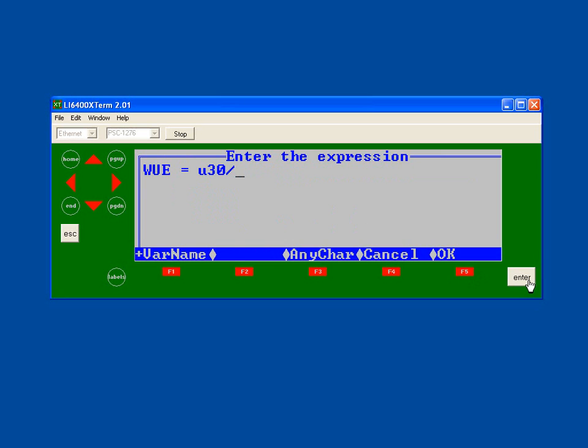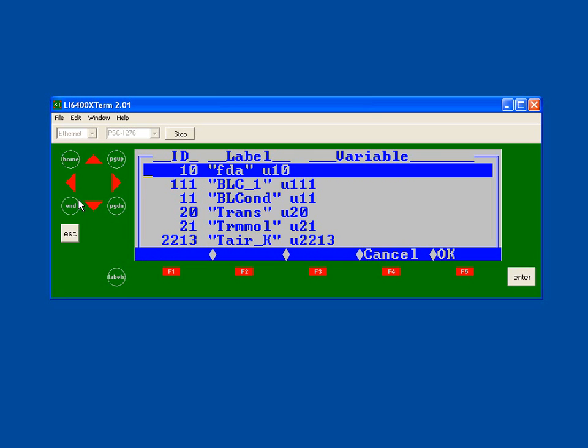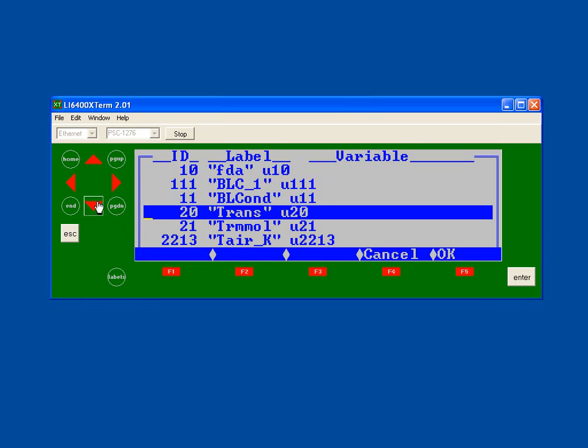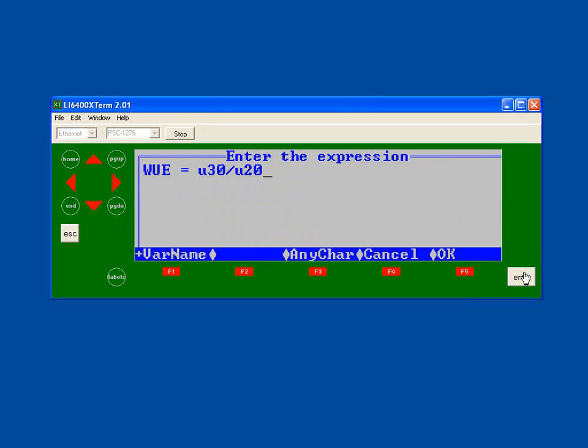So I'm going to take photosynthesis and divide it by transpiration. Again, I will look up the value, number 20, and then I need to do a little bit more math, and I need to do a units change as well as multiply times 100. And that's where I'm coming up with the rest of that computation.